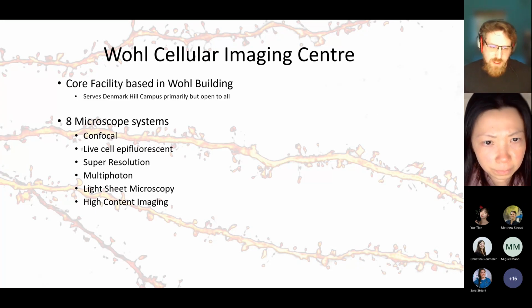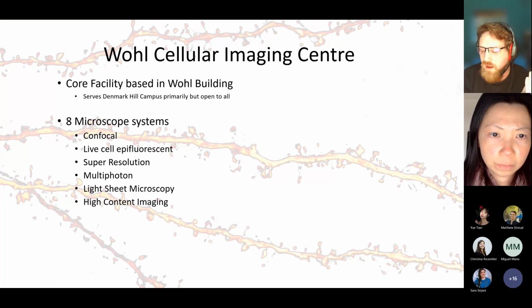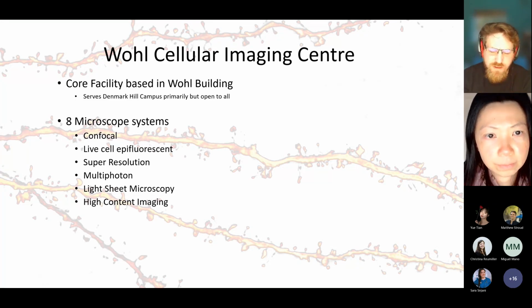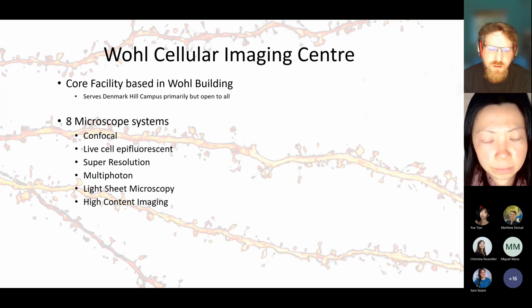The actual buffer that you're imaging in used to be the hardest thing to get right. So apart from the fixing and the staining, you also have to actually image in the correct chemical environment for the blinking to happen. And that used to typically always be a system where you use a reducing agent and an enzyme which oxidizes glucose to try and reduce any presence of oxygen in the solution, and you'd make up this sort of buffer which you had to prepare fresh and put on the sample immediately to image.